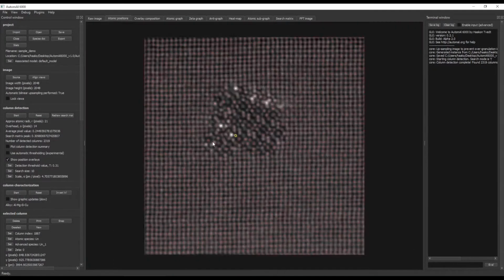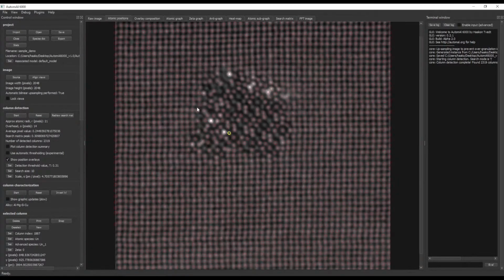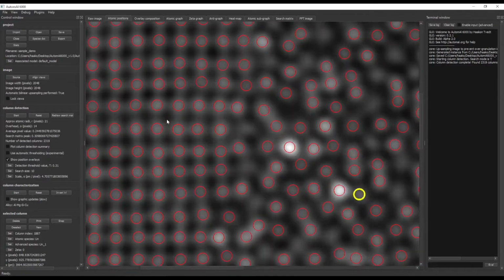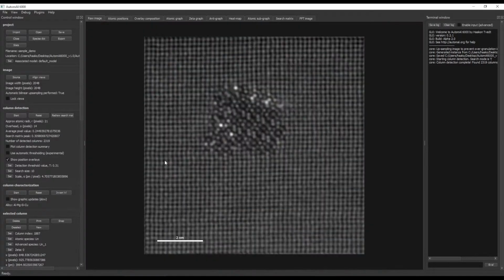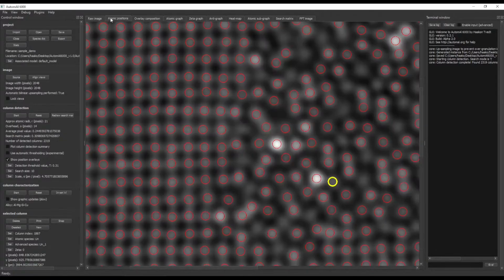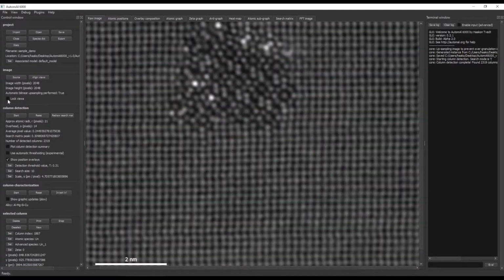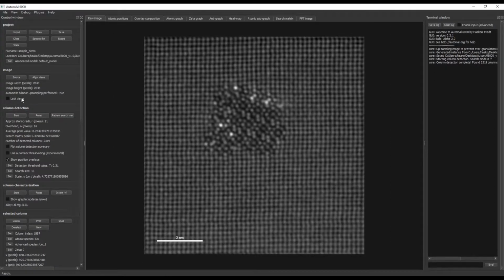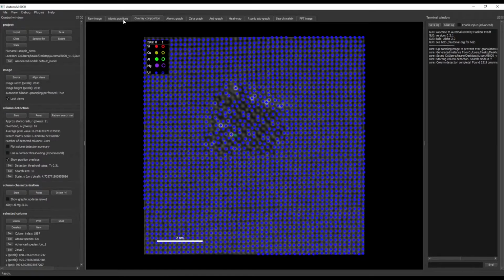And just a quick tip, if you want to hop between tabs and, let's say you are here in this image and this one is over there, and you want them to align, then you can just click lock views and it will lock to the viewport of the current tab. So if I wanted this to be what I want to look at right now, I just press lock view, and if I go to here now, it should be approximately the same position.